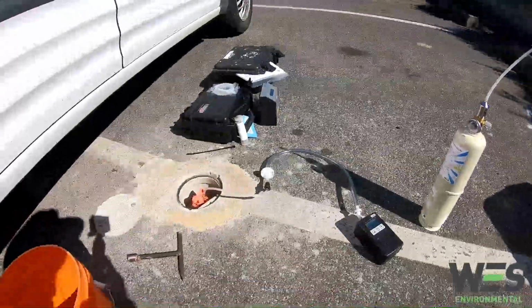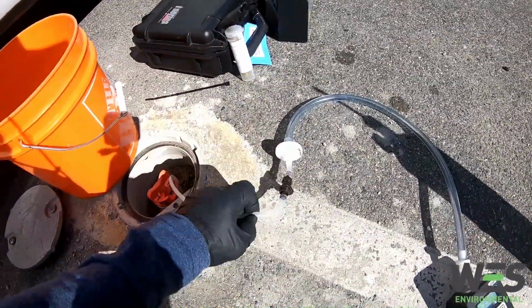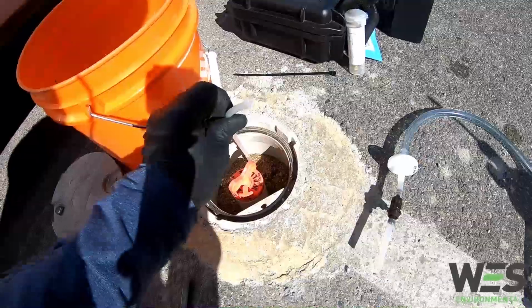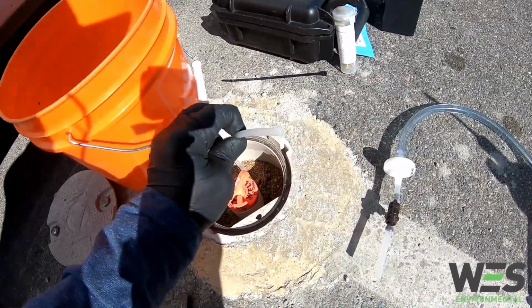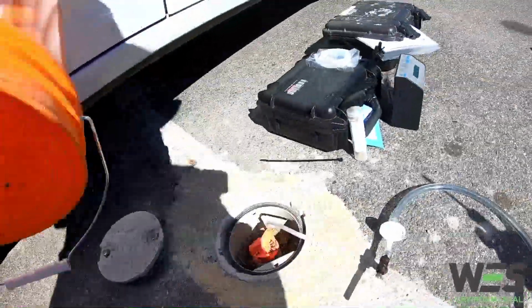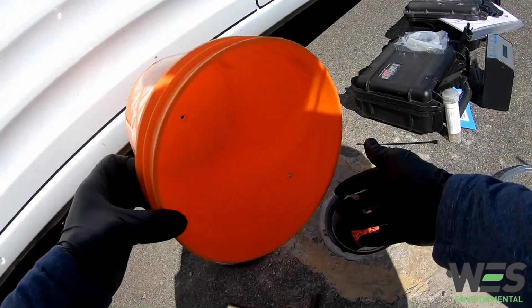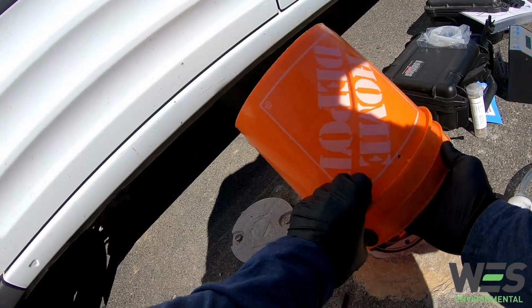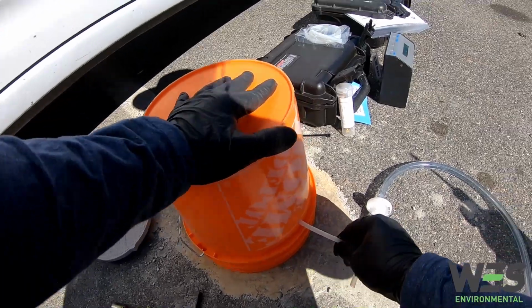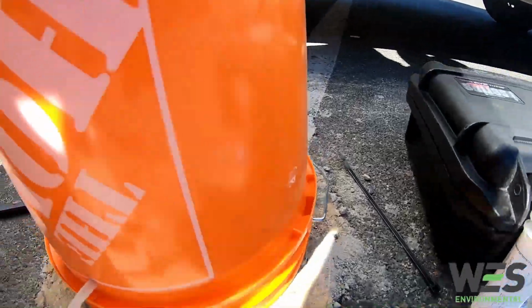Okay, so here we go on the helium shroud testing. This is where we check to see if there are any leaks anywhere along our sampling line. So I've been purging for an hour. Whatever vapor is coming out of here is pretty good and representative. So I'm going to make it so that this tubing comes up from the well, goes into the shroud, and then back out the shroud. Shroud is over top of the well. Sometimes you have to use a little bentonite to seal this off, but this should be good.